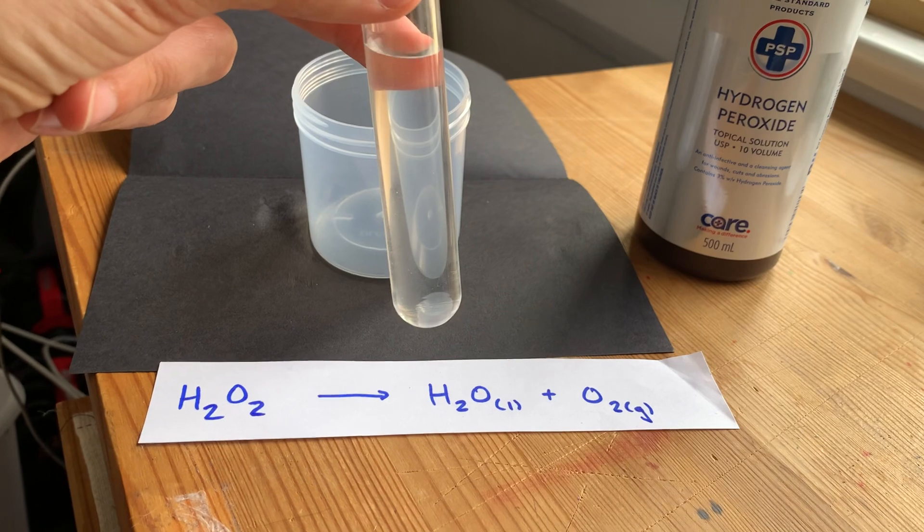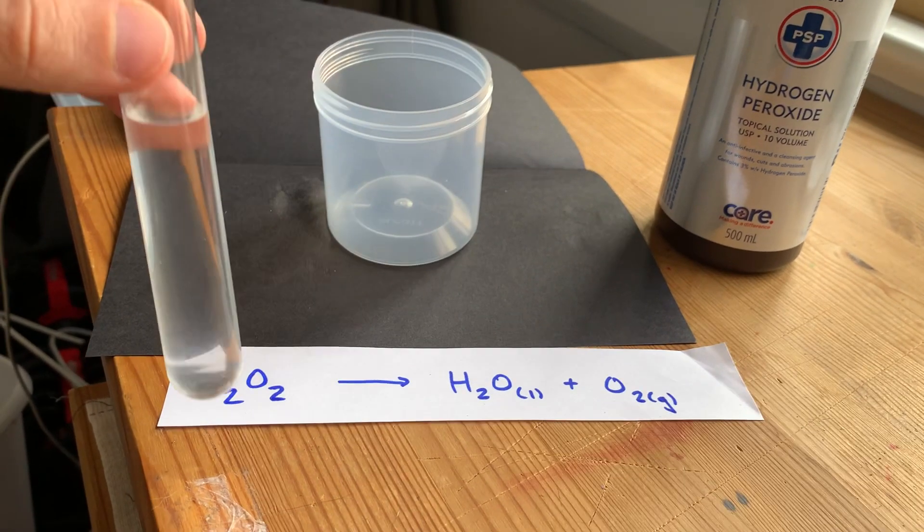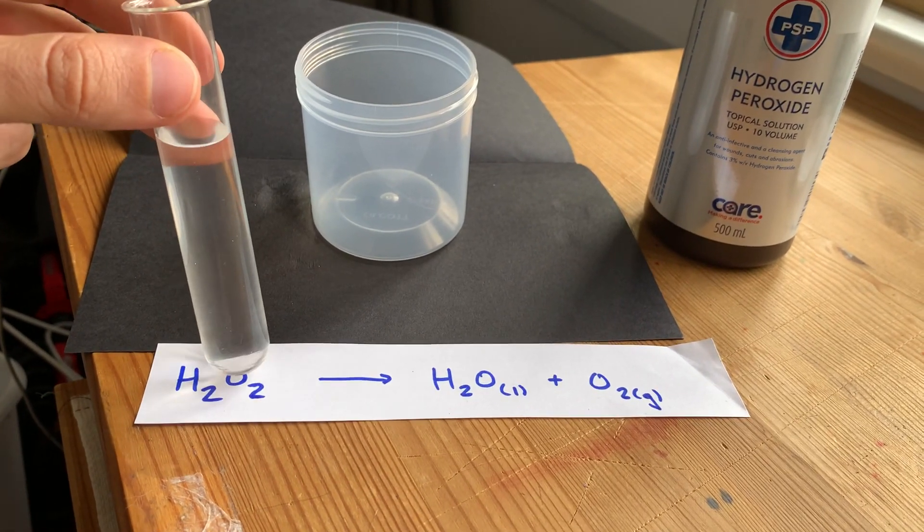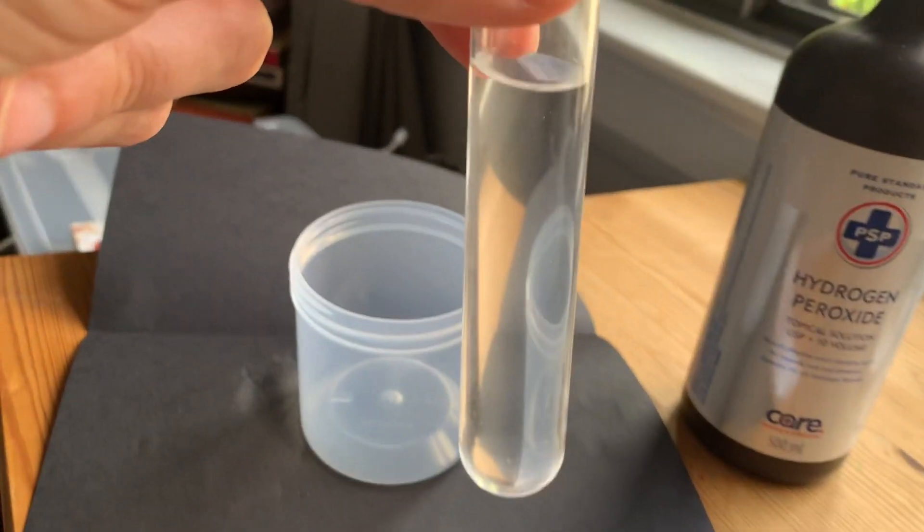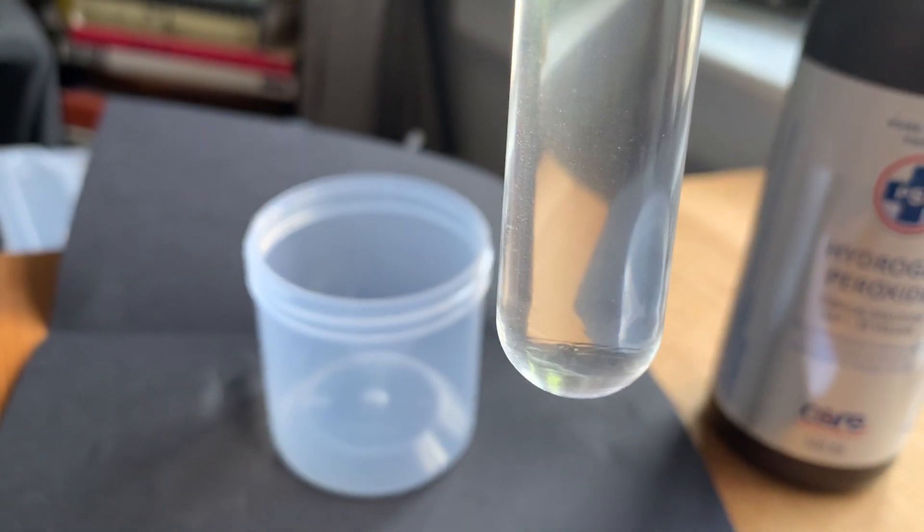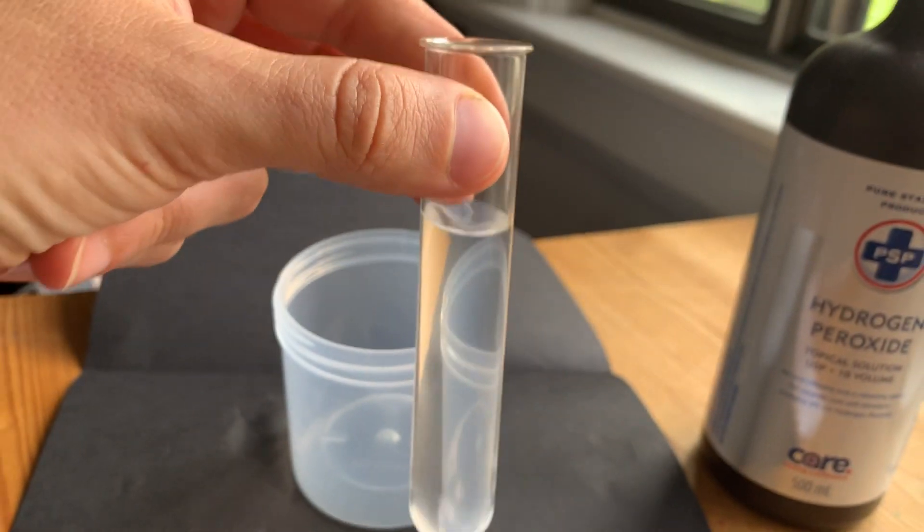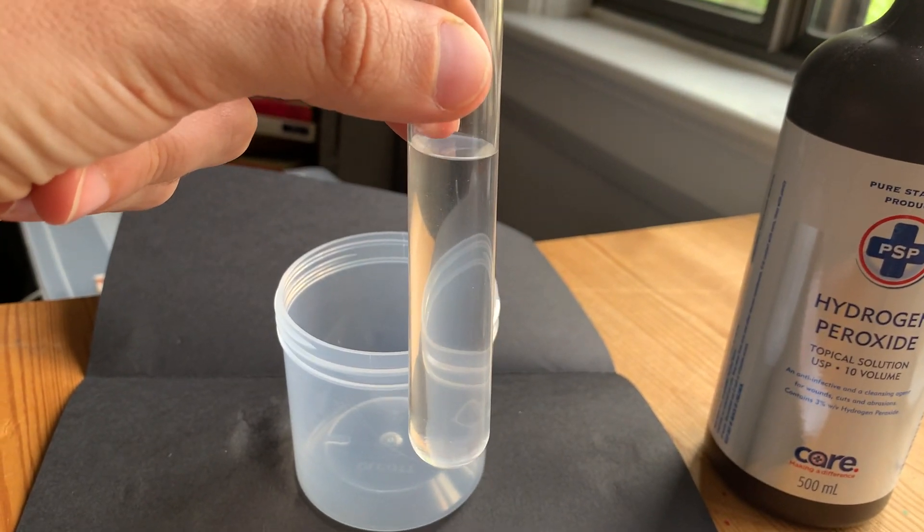Now, hydrogen peroxide does expire. That's because H2O2 will break apart on its own to become liquid water and oxygen gas. There's no bubbles in here because that process is actually very slow at room temperature, but there's a couple ways you can speed it up.